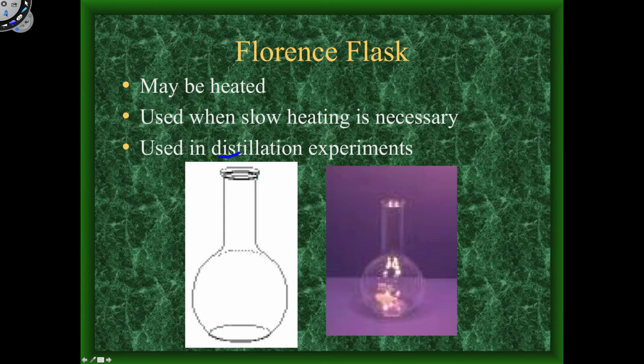So if you have alcohol and water, for example, mixed, you're going to see that the alcohol will boil first because it has a lower boiling point. The water is a little bit higher. So distillation is the separation of liquids by their boiling points. And Florence flasks are typically used for that type of experiment.